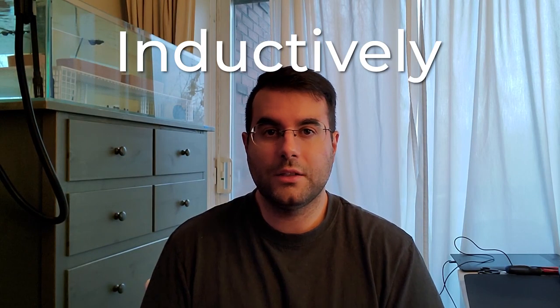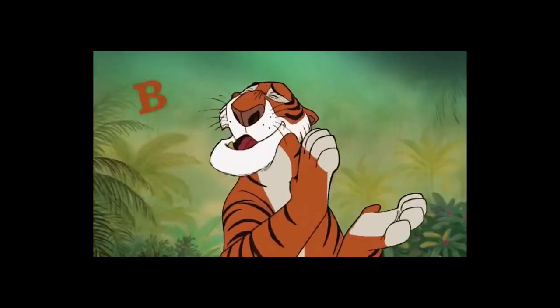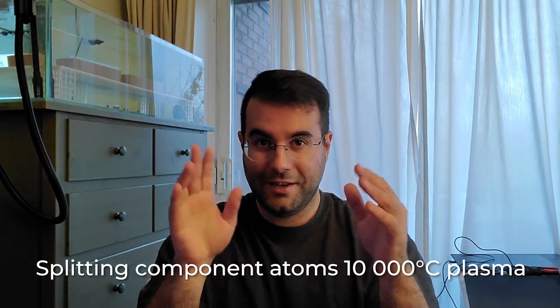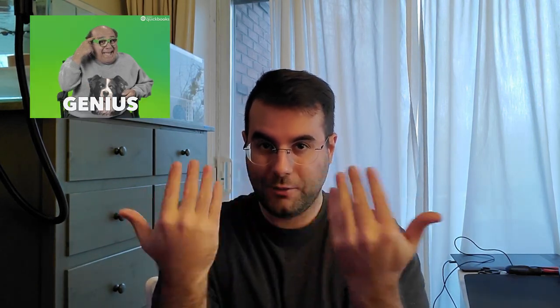It stands for inductively coupled plasma. Bravo. And on top of that, they have the optical emission spectrometry. All right, listen to me. I have no clue what it means, but it sounds super great. It has the word plasma and stuff. It's cool. It sounds really good. All I know is they shoot a plasma into the water and it breaks down the components of the water so they can know what it's made of.